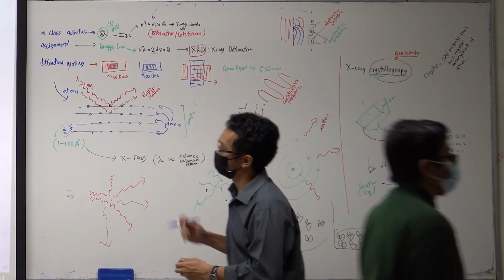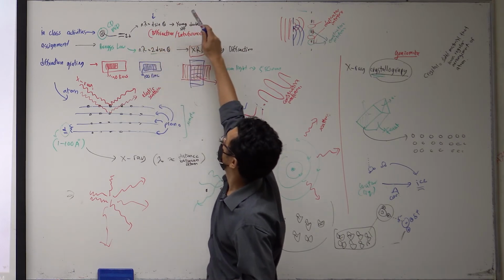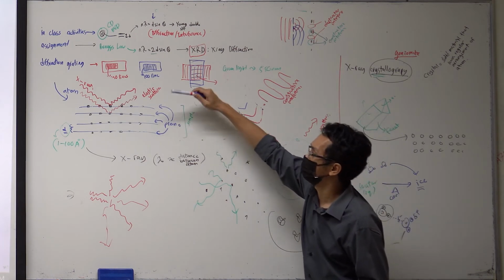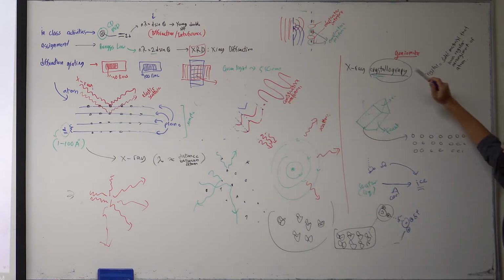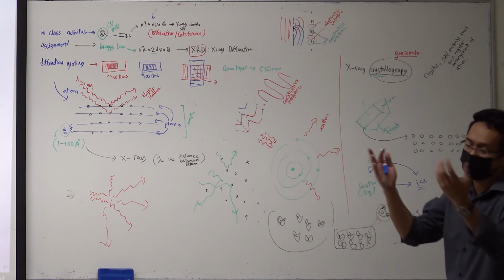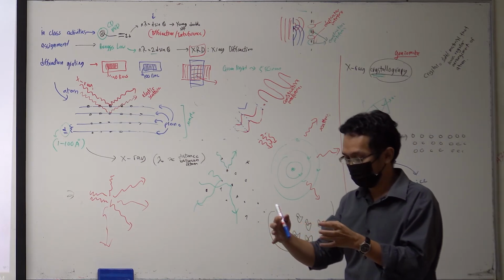So that is basically the X-ray we learned now. We learned about the relationship between Bragg's law, the Young double slit, the idea of how to use diffraction and interference in XRD for atoms. We learned about scattering. We learned about X-ray crystallography, why we need crystals, what a crystal is, and how people normally make crystals. Typically they evaporate the water, but we will not deal too much with that because it's a very specific field.